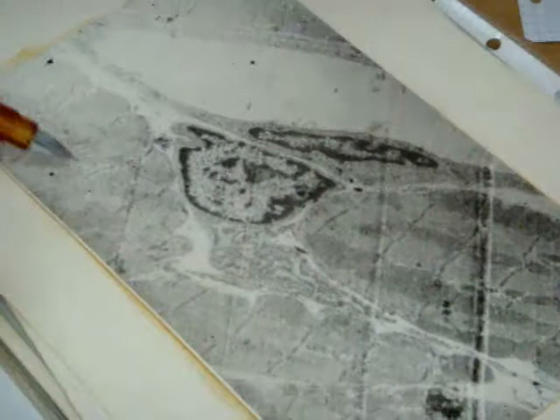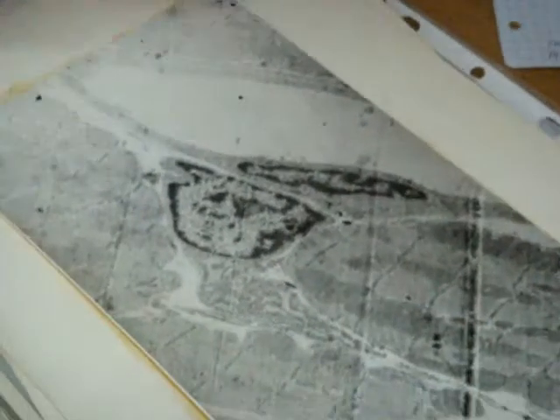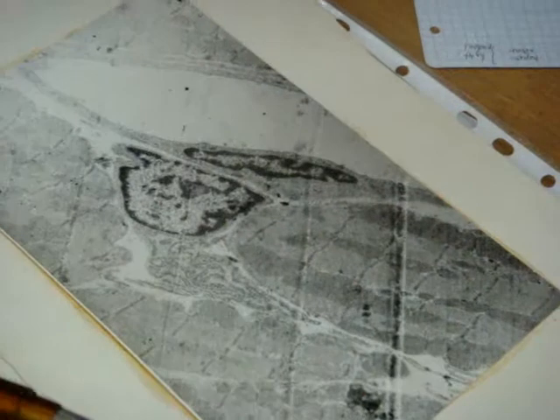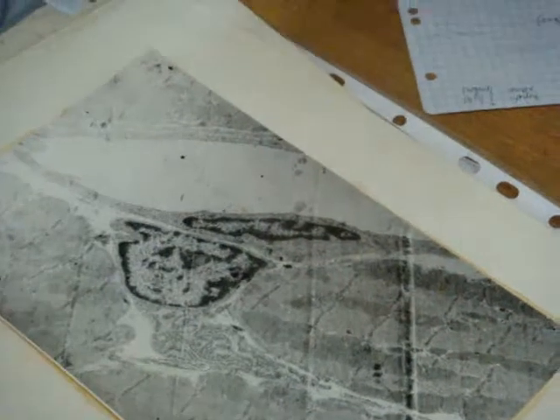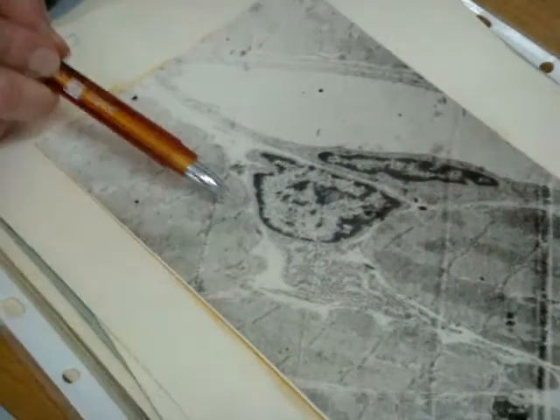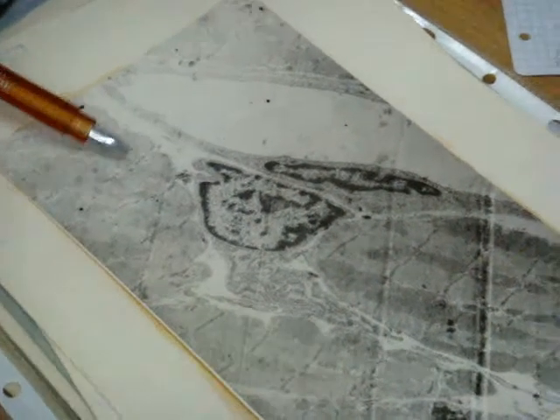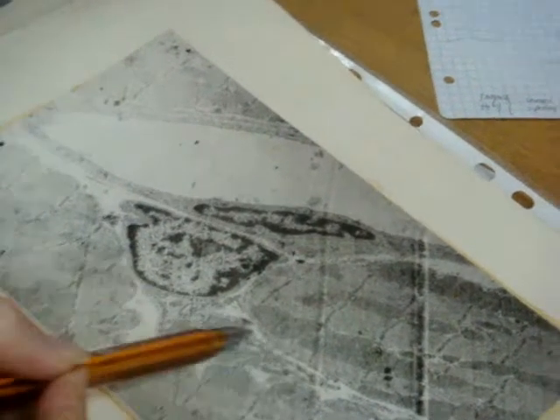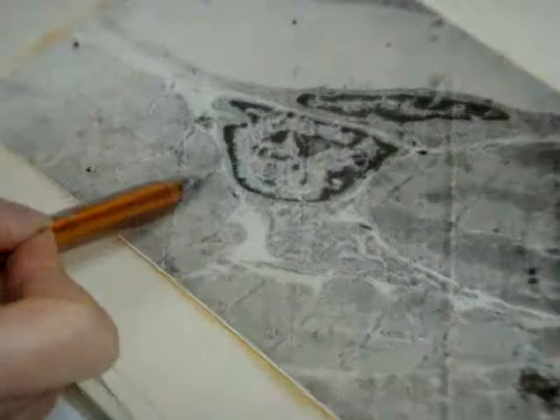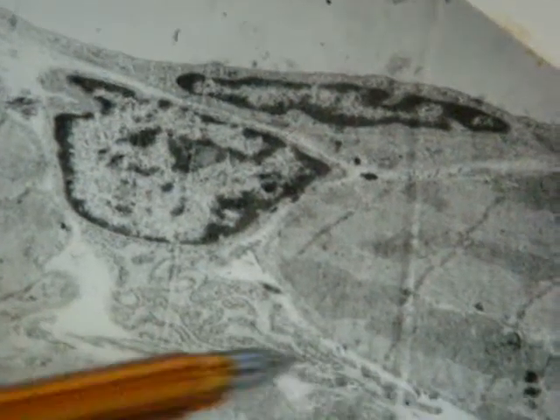1, 2, 3, 4, 5, 6. This is muscle. We can see myofibrils. This is sarcomere structure, that line. And if this invagination is the beginning of formation of tubules, we can say that this is all cardiac. Let's look at this. This cell without basement membrane, with rough endoplasmic reticulum, is a fibroblast, and we can see collagen fibers around. What is it? Blood vessel, yes, a blood vessel with lumen, and the basement membrane is visible, very clear, yes?